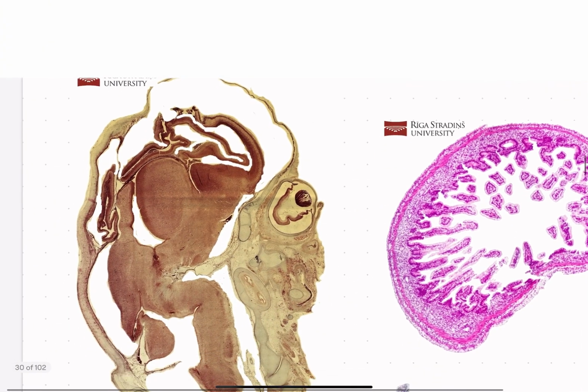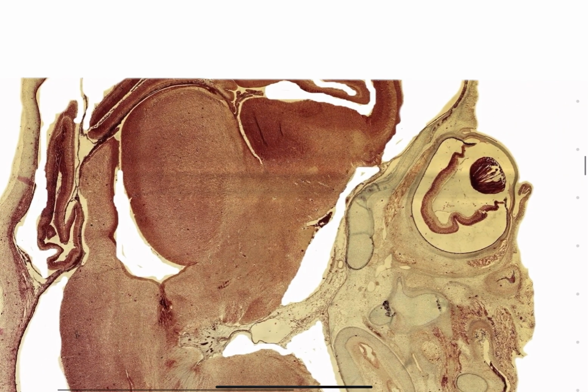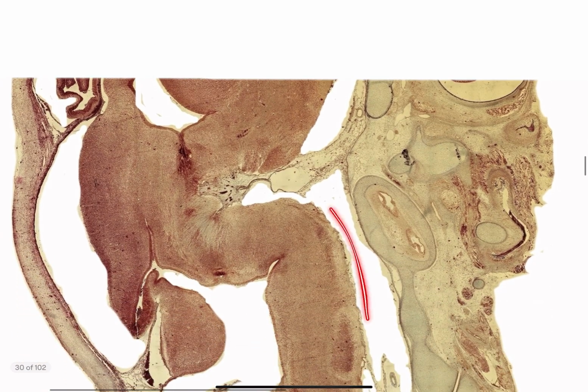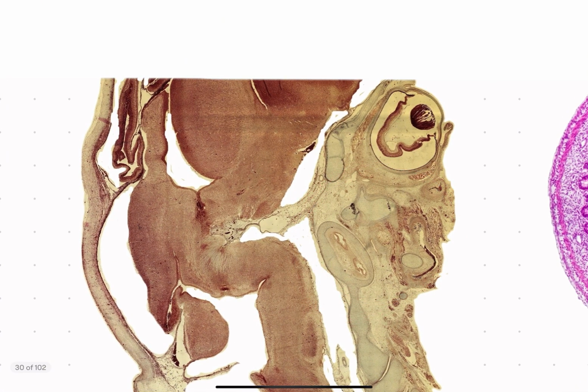And in this class, we're going to look through brain development, especially when it's more zoomed in, like it is in a microscopy slide. What signs we're looking out for in terms of brain development, which structures in the brain are the most important, as well as some other head structure derivatives that we need to know.